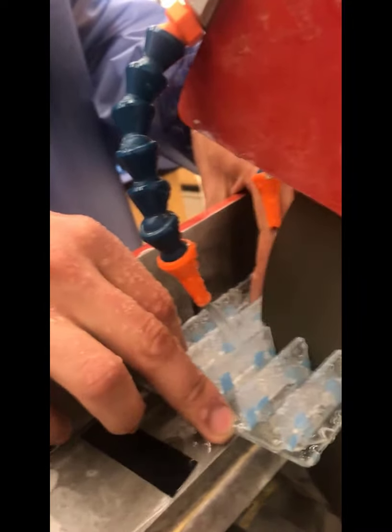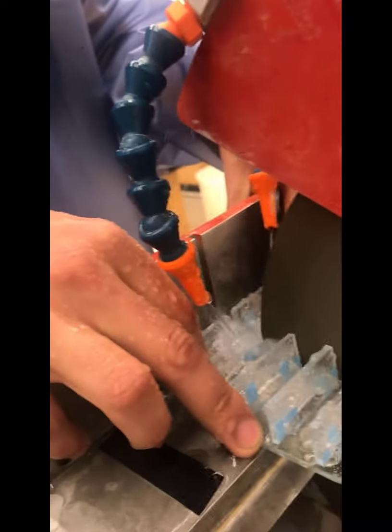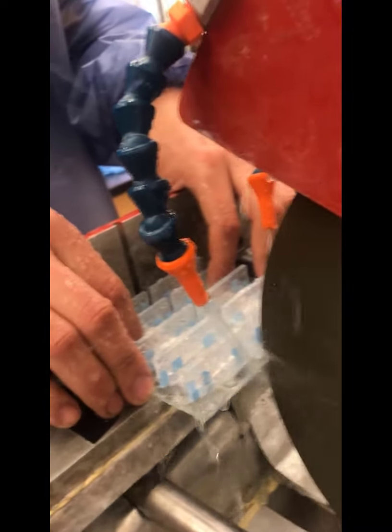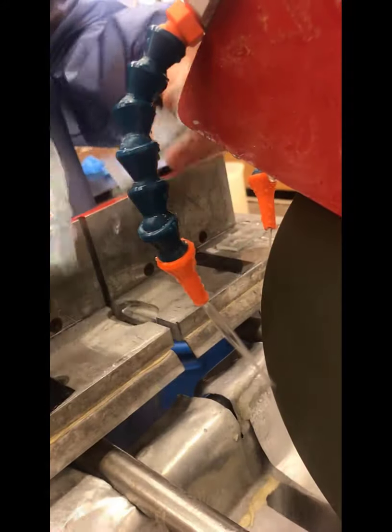This will liberate the two halves of your FTO sheet, and so you'll be left with a sheet of 5 devices and another sheet of 5 devices. The depth of the actual saw can't cut through the entire width of the FTO sheet, so you'll have to flip it around and cut it from the other side. So there are your 2 sheets.